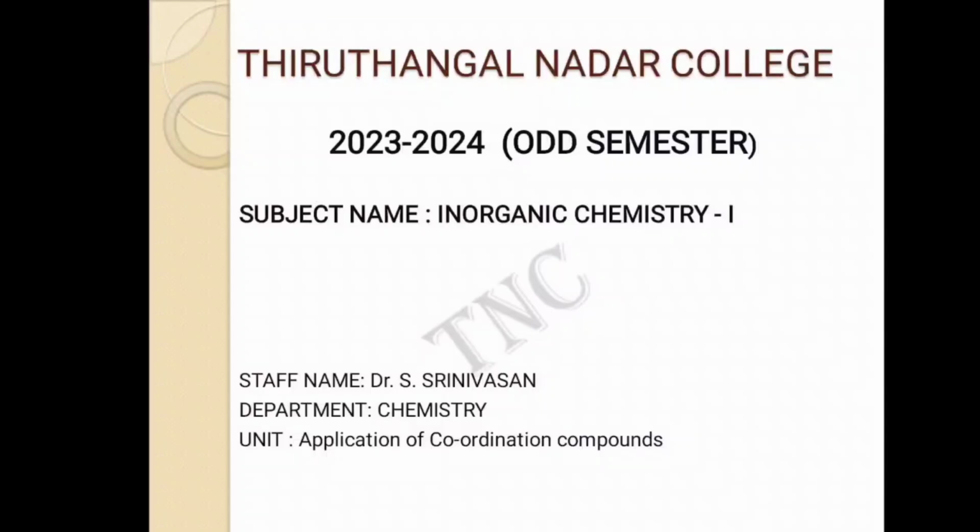Hello everyone, I am Dr. S. Srinivasan and I will be talking about application of coordination compounds. The first topic is estimation of nickel using DMG.